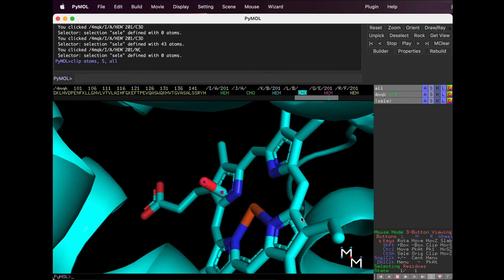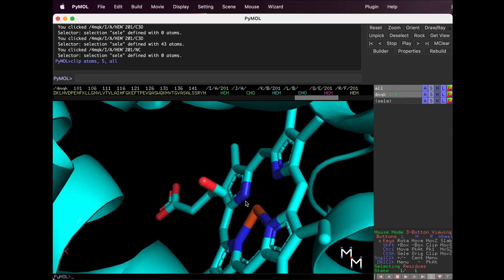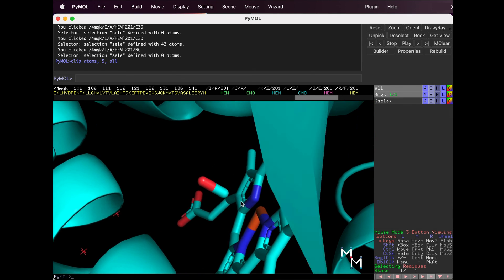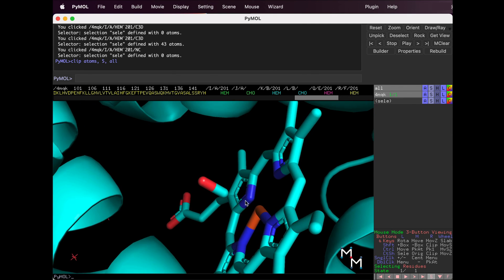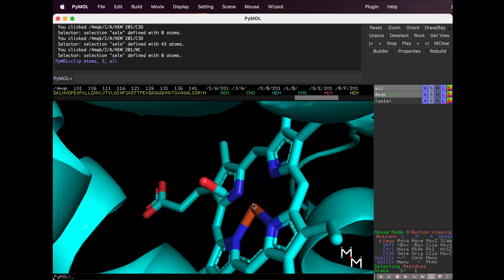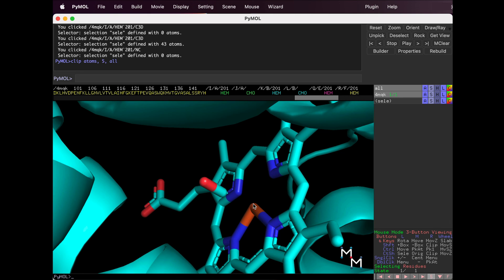Carbon monoxide binds well to hemoglobin and can prevent oxygen binding. This is the basis for carbon monoxide poisoning.